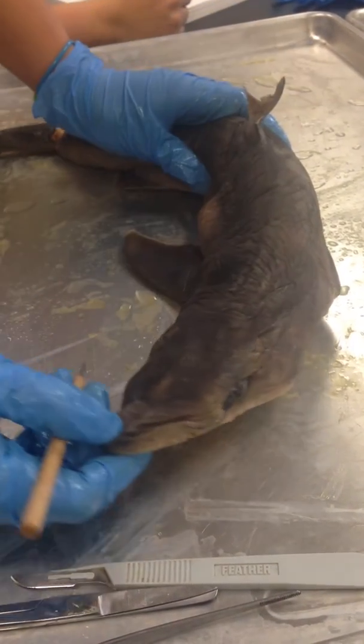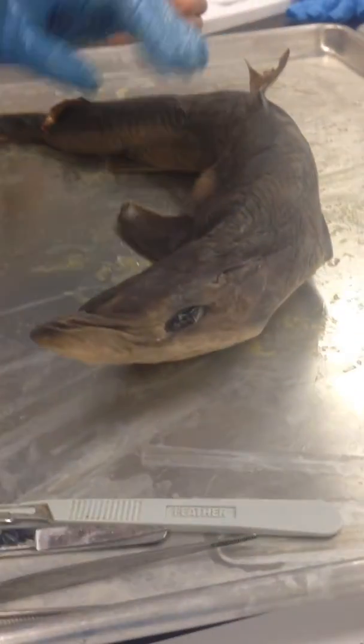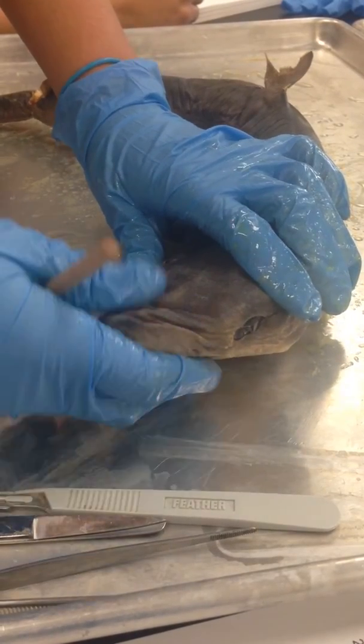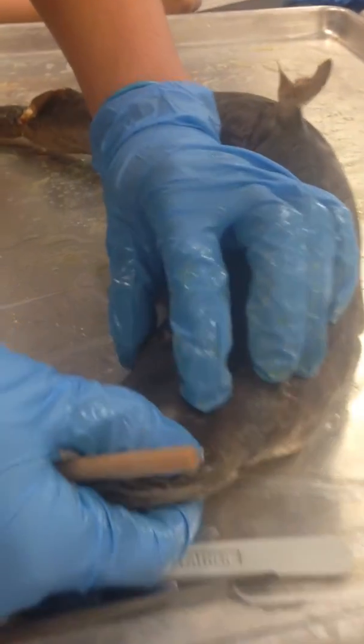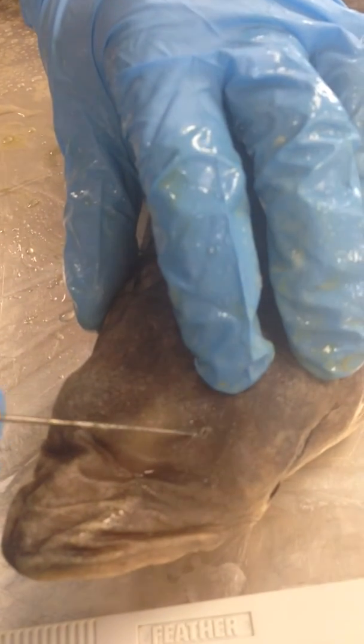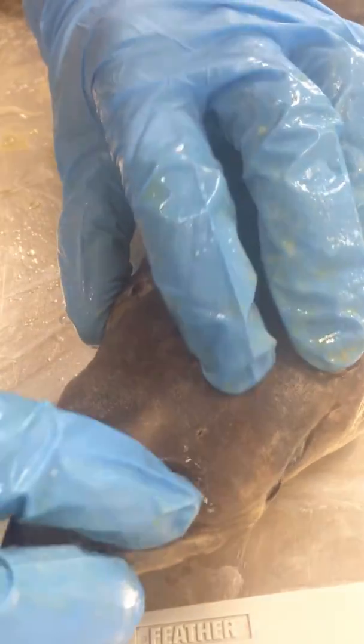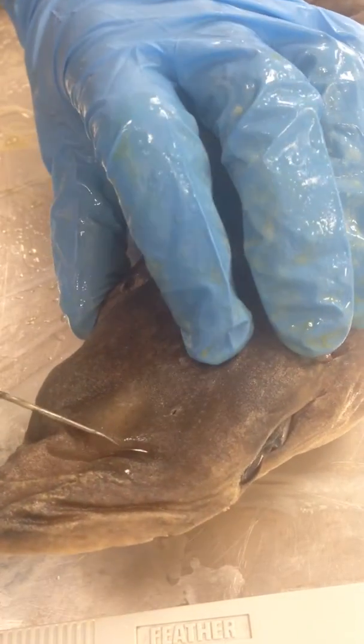This is the external view of the dogfish shark. Right here at the front is the snout, and if you look, there is this pore right here. It's called the ampullae of Lorenzini and it excretes mucus.